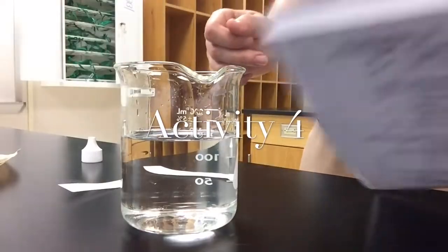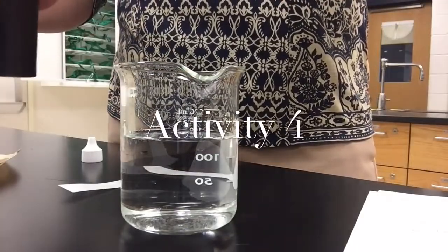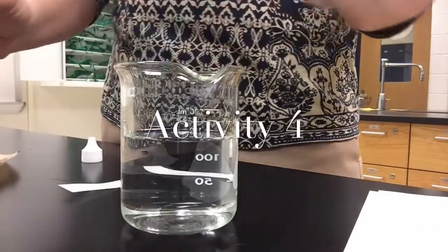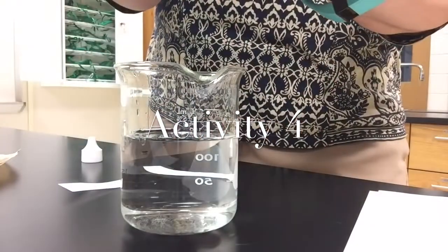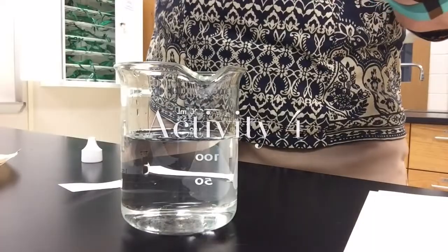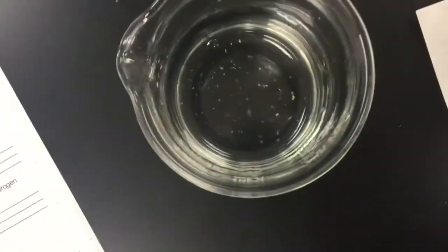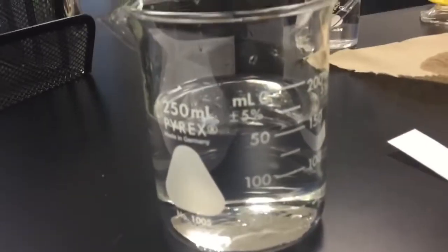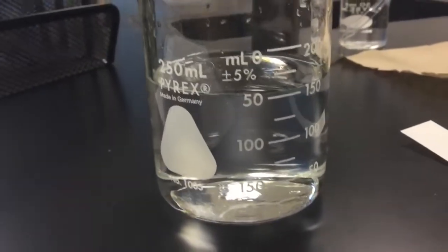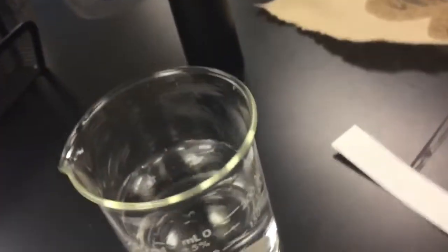Now we have a 250 mL beaker that is half full with water, and we're going to take one shake of pepper - just regular pepper - and sprinkle it onto the top. Here we go, sprinkling the pepper onto the water. As you can see, it is staying on top of the water - you don't see it falling down, it is still on the top.